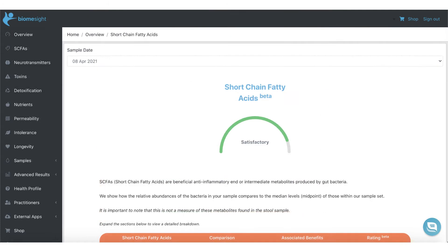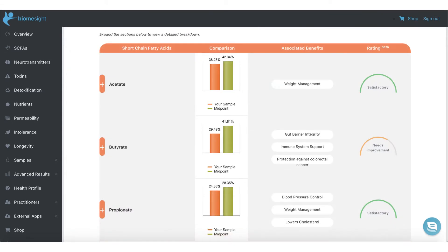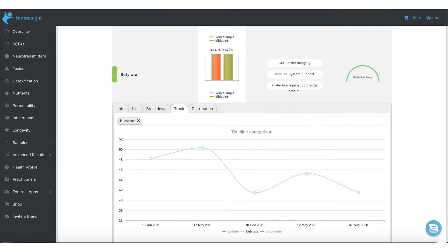We also compare your level of short-chain fatty acids to the other results in our sample set, which again comes complete with scores, comparisons, and tracking across samples. We cover butyrate, acetate, and propionate. The timeline is also available on the various metabolite views.